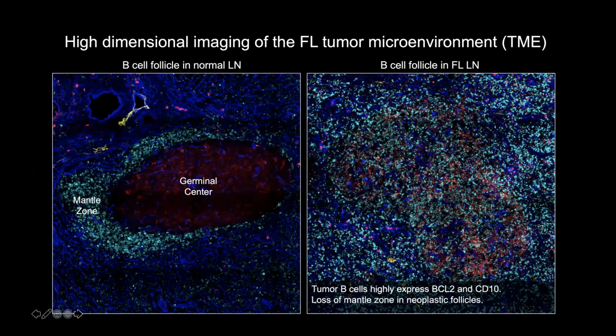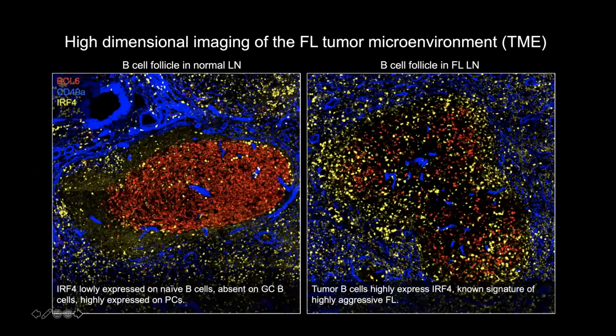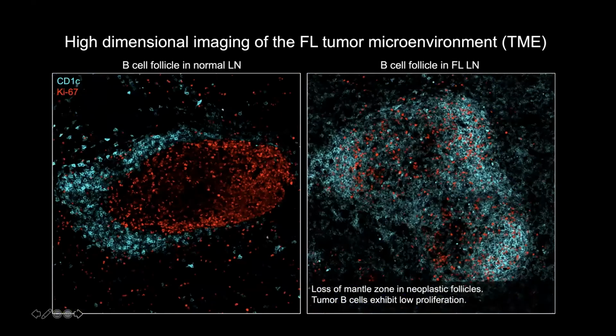I'm just going to go through each of the markers here so you can see the cellular resolution we're able to obtain. It's shown as an 8-micron Z-stack because it's acquired with a confocal. So you can see the different spatial patterning and the kind of markers that we can look at in situ. We get nuclear markers and differential expression; you can see that even though the dynamic range is only 8-bit. I'll just stop talking as you go through the markers.